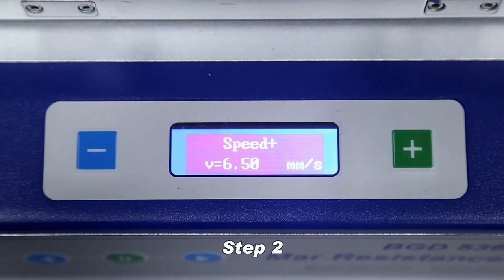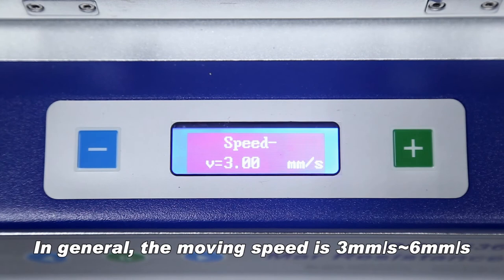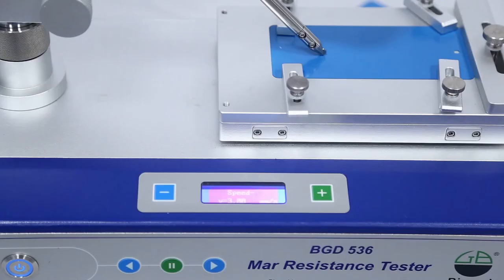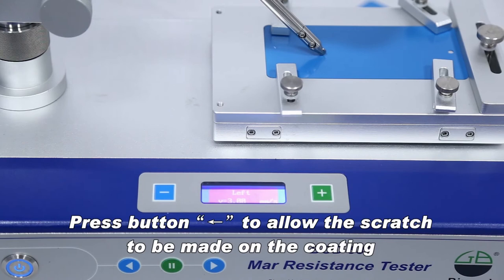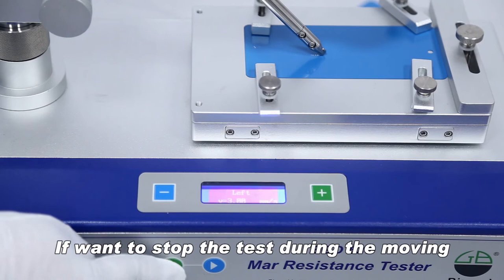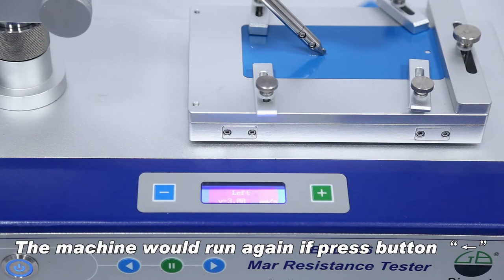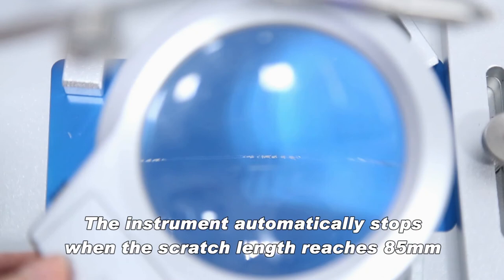Press button plus minus to set the moving speed according to the test requirement. In general, the moving speed is 3 mm per second to 6 mm per second. Press button to allow the scratch to be made on the coating. Press button to stop it. The machine would run again if press button. The instrument automatically stops when the scratch length reaches 85 mm.